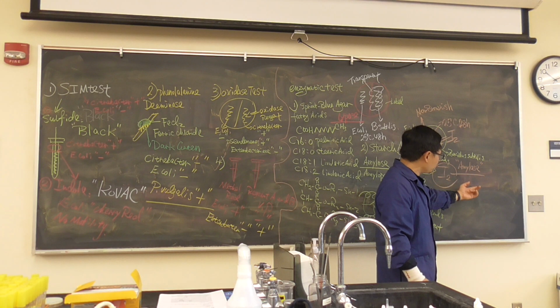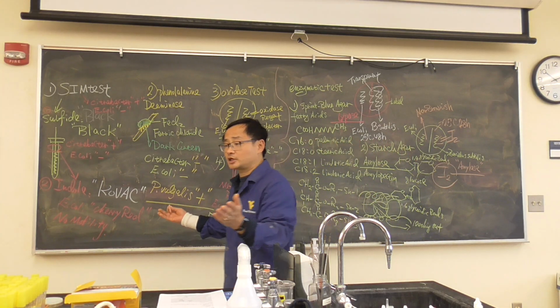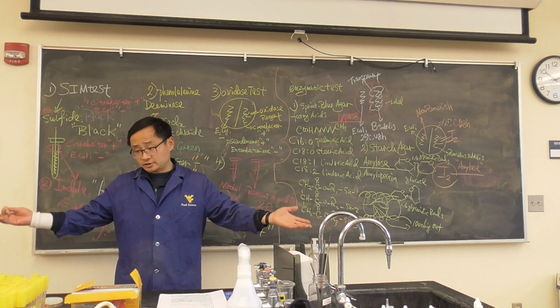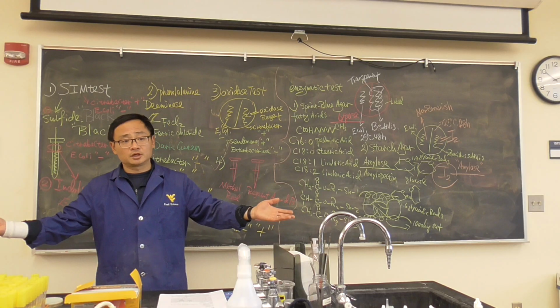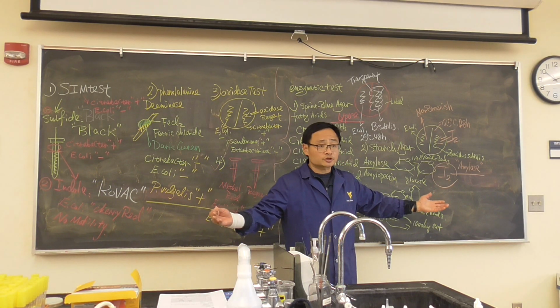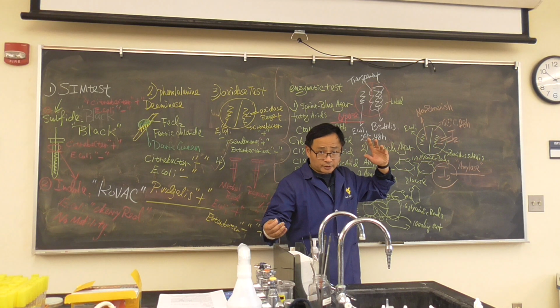If bacteria has amylase, it will break down starch. Once they break down starch, it becomes what? Glucose, or dextrose sometimes, it depends. Polysaccharide becomes monosaccharide. So what do we see on the agar? There's no brownish color once we pour iodine. So this twists your mind a little bit, okay?